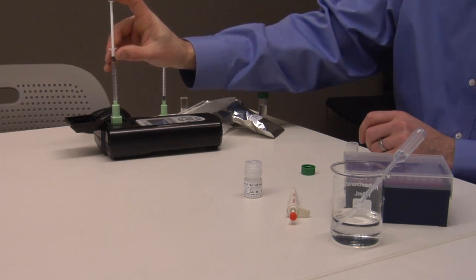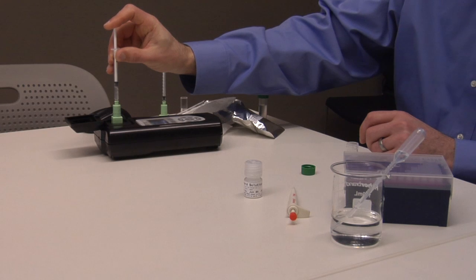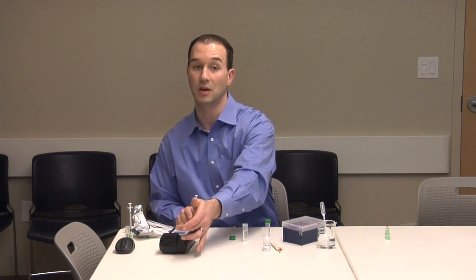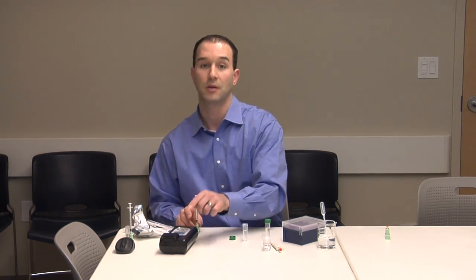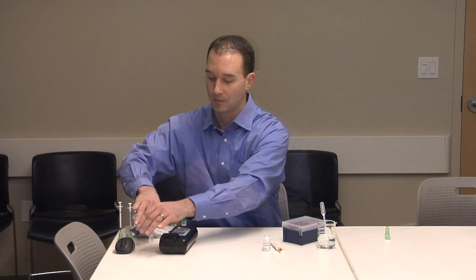Maintaining a constant speed over 3 to 5 seconds, carefully squeeze the sample through the housing into the cuvette. Remove the syringe and housing immediately and then quickly close the sample door. Press start. This will take about a minute. When indicated, remove the cuvette from the sample chamber. When the second test is complete, the results of the site calibration will be displayed. It will contain a calibration factor associated with that site.